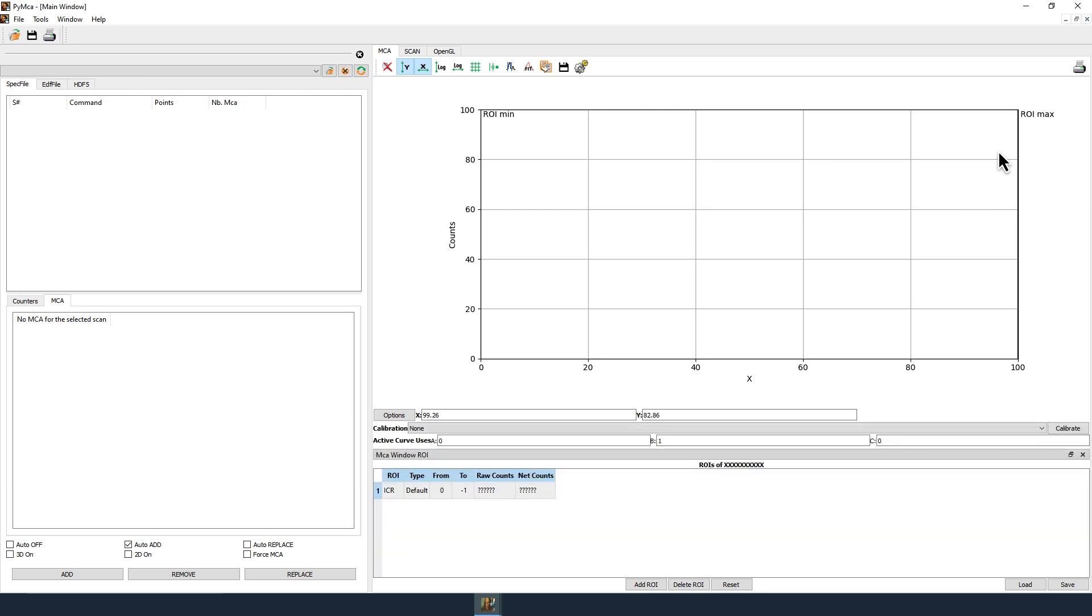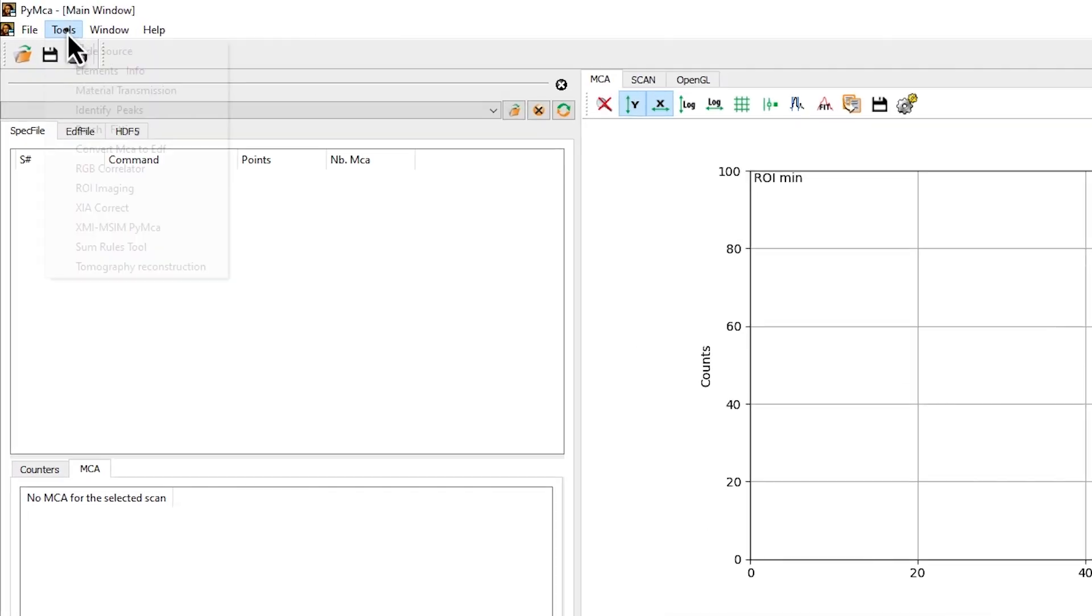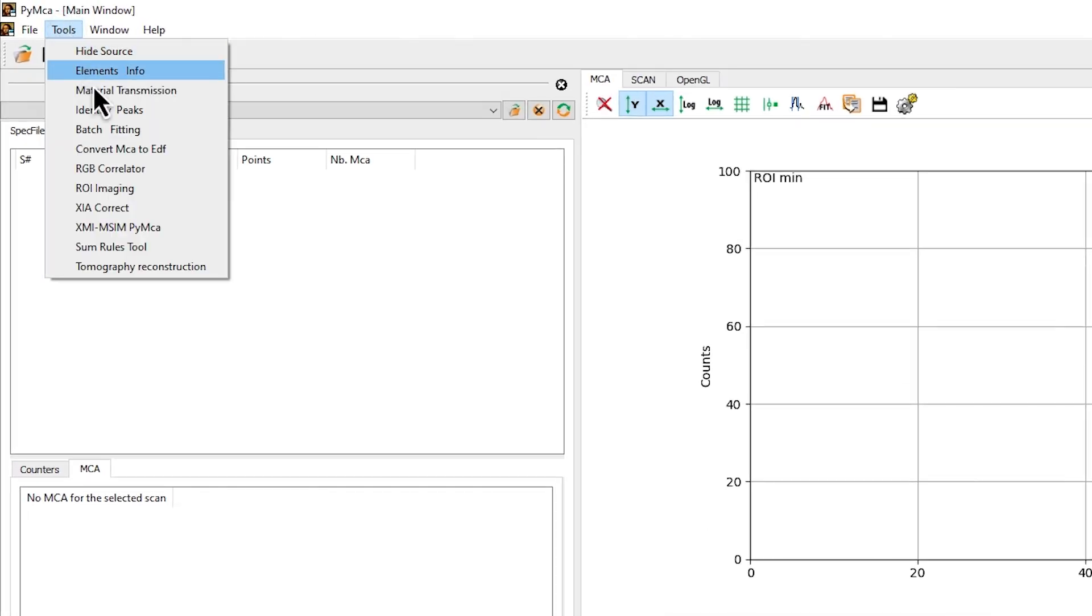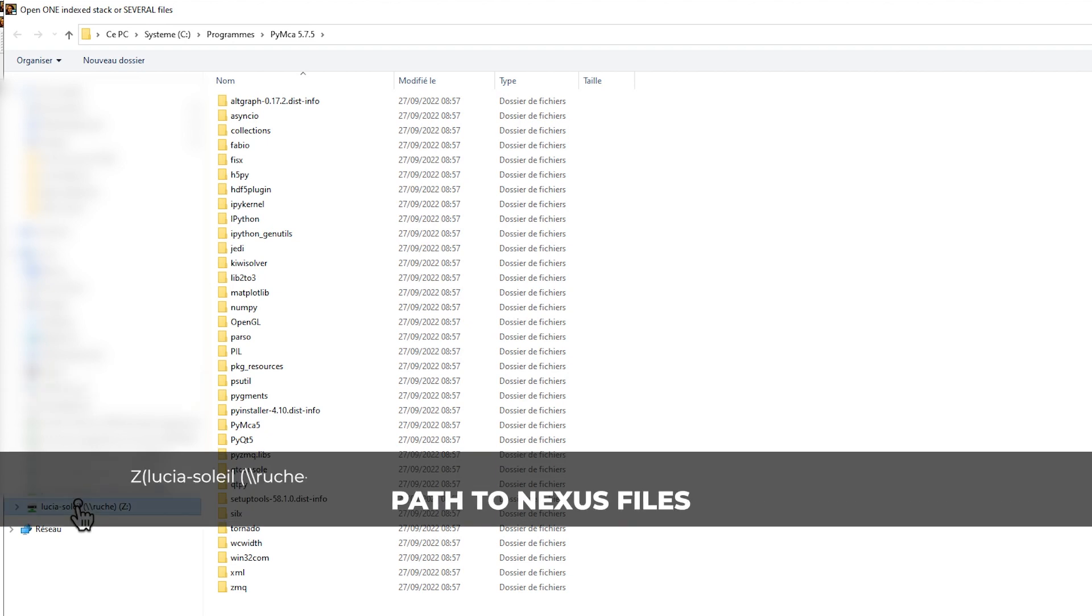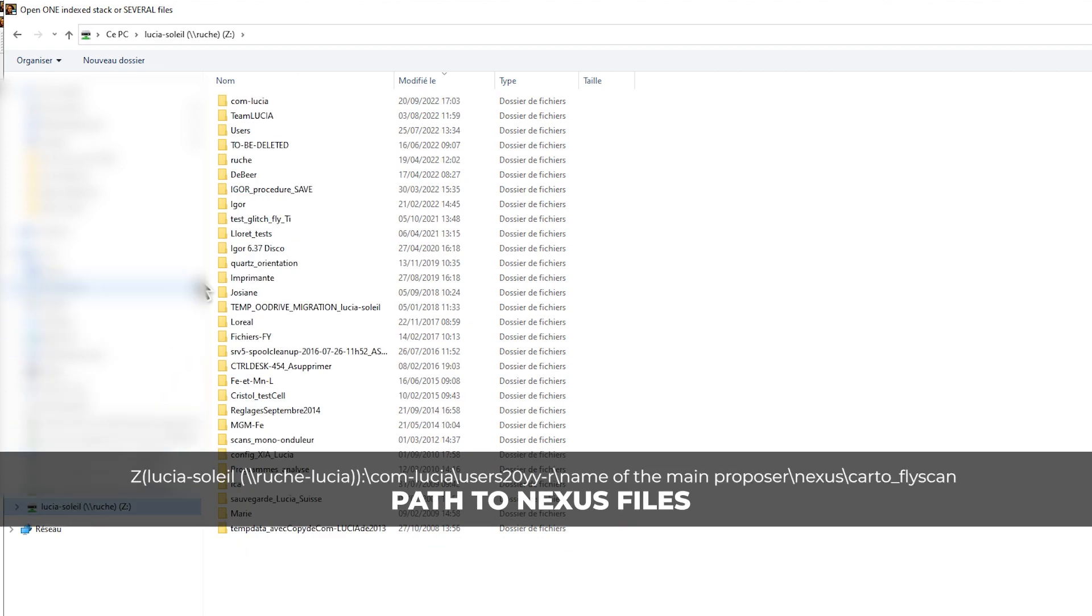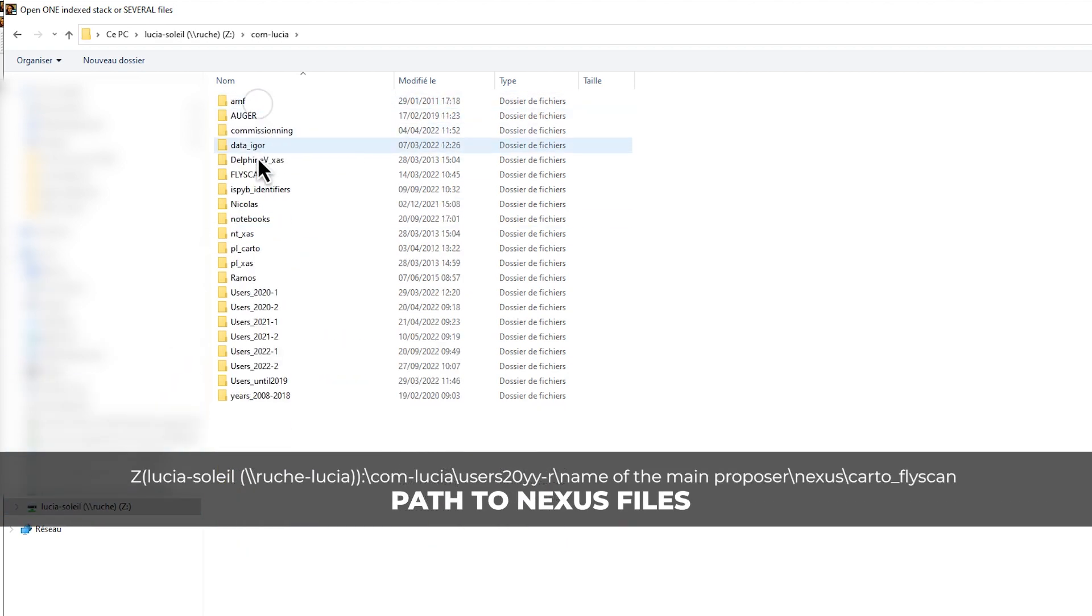Open PyMca. To open a Lucia X-ray fluorescence map, click on Tools, then ROI Imaging. Browse directories to find the file of interest. The Nexus files are located on the ruche Lucia Soleil Z drive.